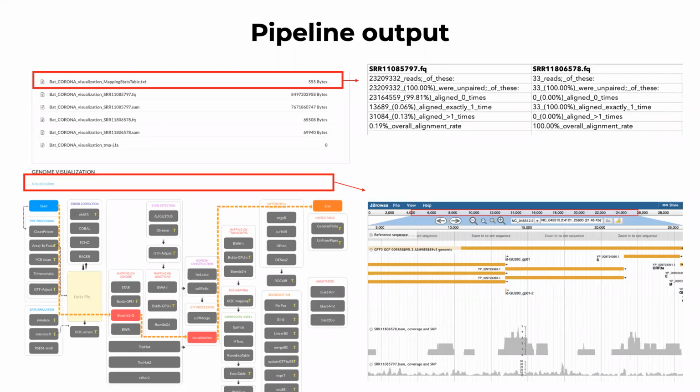Okay, so if you think about it, taking the unmapped reads is really just an extra step, because it reduces the number of reads. What if we didn't reduce the number of reads? It will be computationally more expensive. However, the genome here is not that long. It's only 30,000 bases, right? I wouldn't do this if we were mapping on a database, because the database has millions of viral sequences. But here we only have a single sequence, so we can map onto the reference genome.